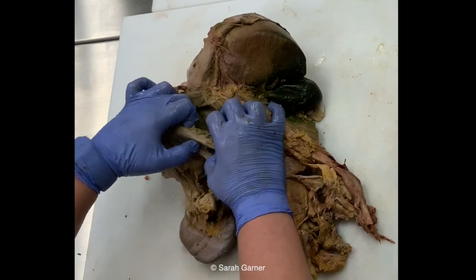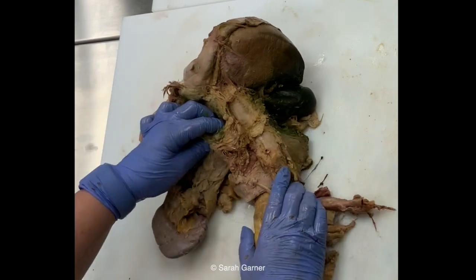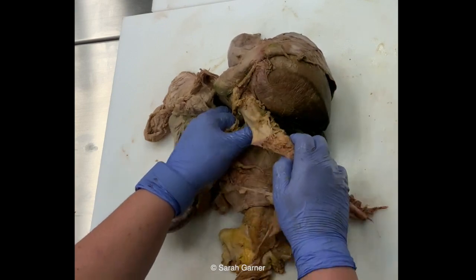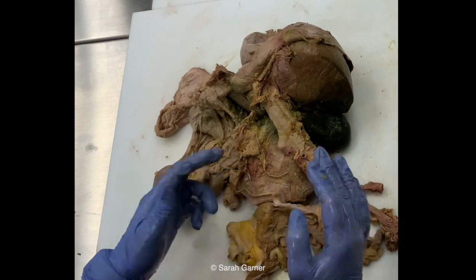Now, if there's anything that you need to examine, you should do so, like inter-organ relationships, patent vessels, patent ducts, things like that. All of that you need to keep in mind. A lot of that is going to be institution dependent and also case dependent.